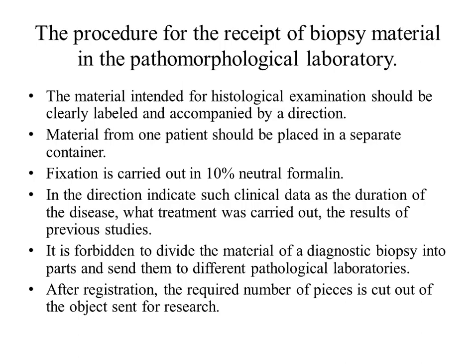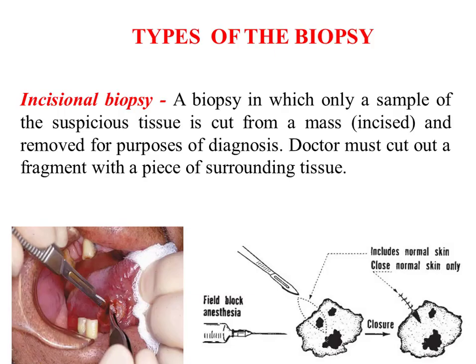After registration, the required number of pieces is cut out of the material sent for the research. Types of the biopsy. Incisional biopsy. It's a biopsy in which only a sample of the suspicious tissue is cut from the mass, incised, and removed for the purposes of a diagnosis. The doctor must cut out a fragment of pathological tissue with a fragment of surrounding tissue. It's very important, not only the pathology.